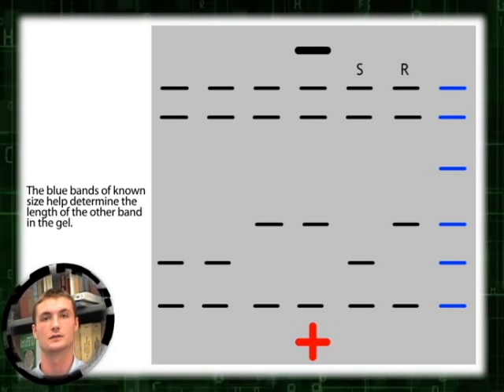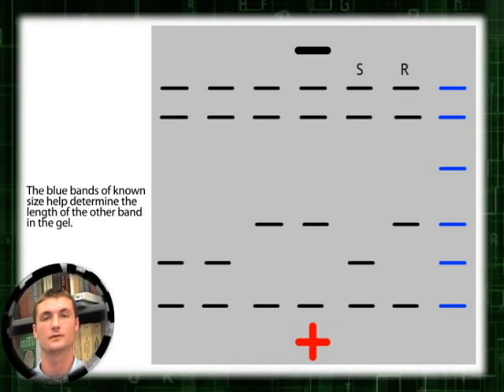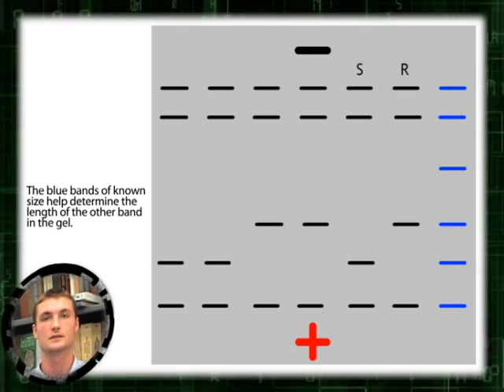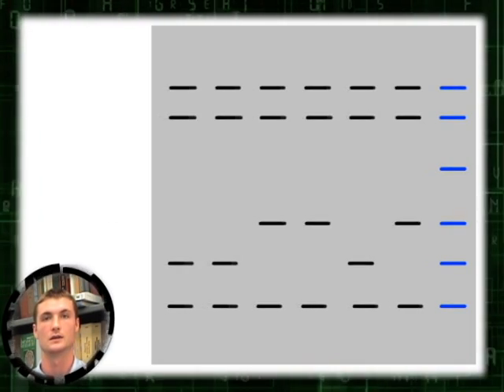Each lane on the gel contains PCR amplification products from a single plant. We can estimate the size of the fragments relative to a standard, shown here in blue.